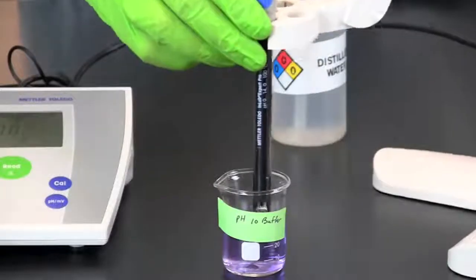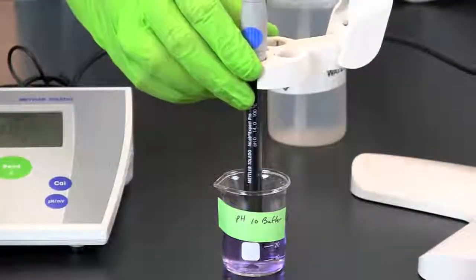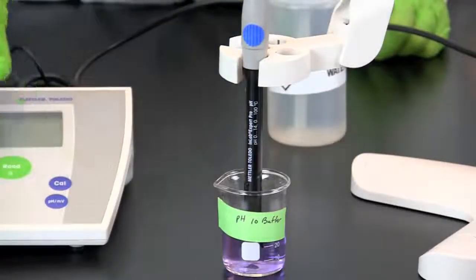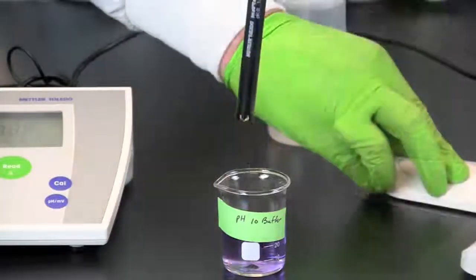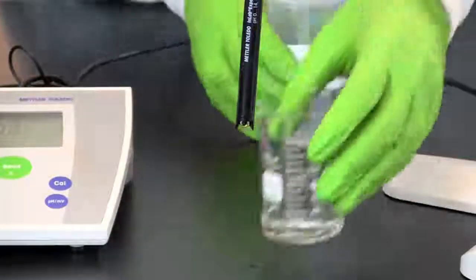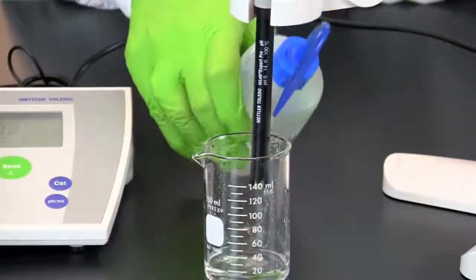You will then calibrate the final standard with a pH of 10. When the pH 10 standard has been calibrated, rinse off the electrode with distilled water.